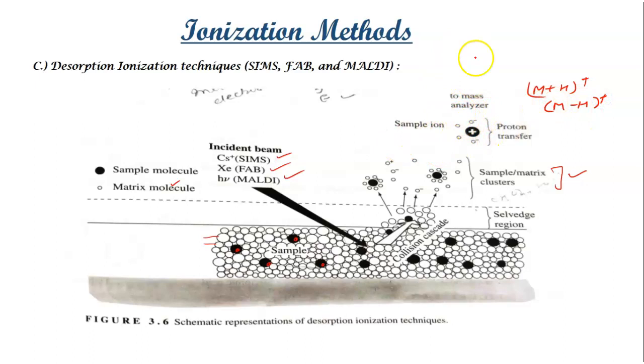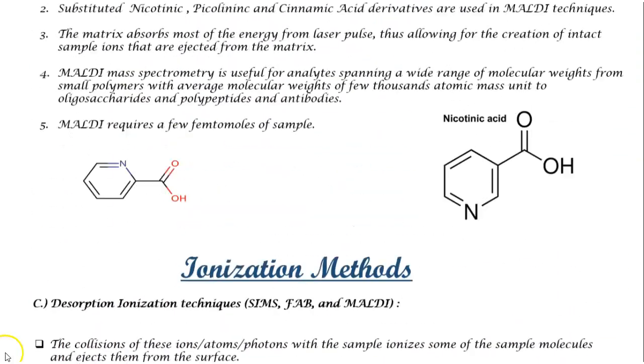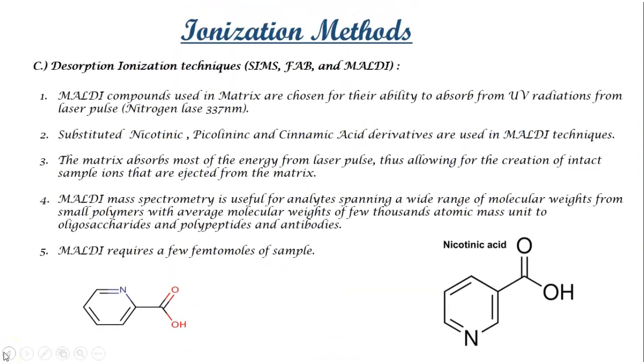So in the detector, using mass by charge ratio, they are going to get detected. Okay, and that's how it is ultimately going to happen. This particular technique is quite easy to understand, right? So switching back to the previous slide. Alright, so now we are going to see the matrix, about what kind of matrix should be used.